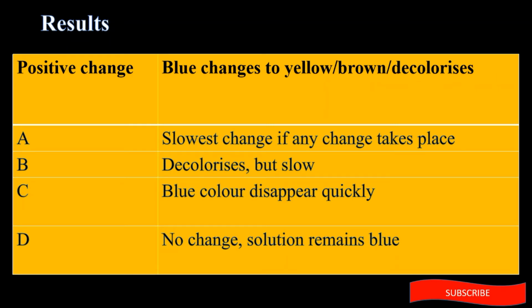That is to show that your starch was somehow digested. Because it was digested, your solution will change from blue to yellow. If not yellow, this can be brown. If not brown, your solution will be discolorized. That is to show that your enzymes were somehow working.